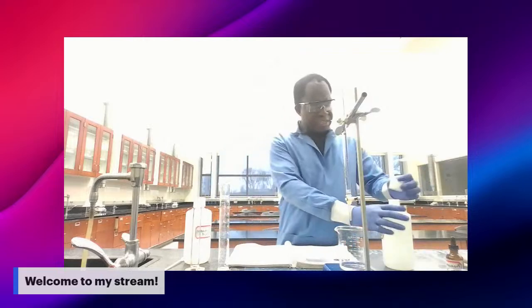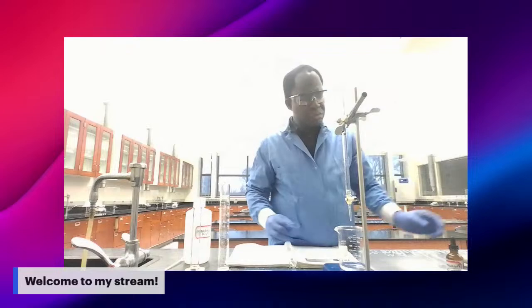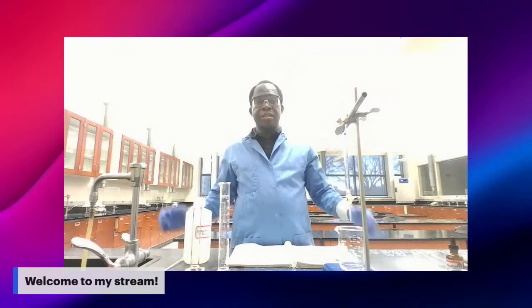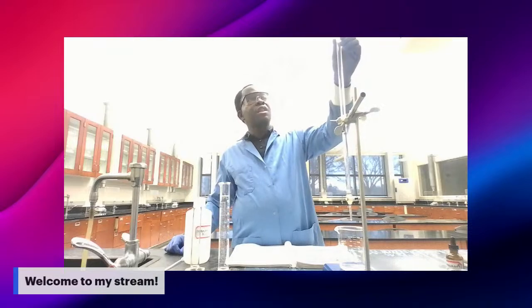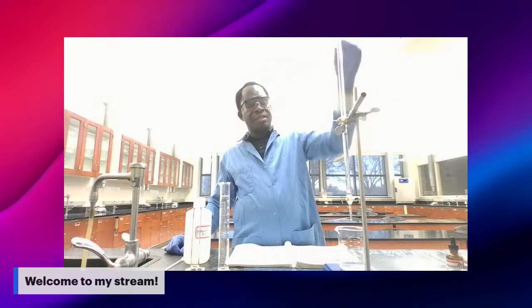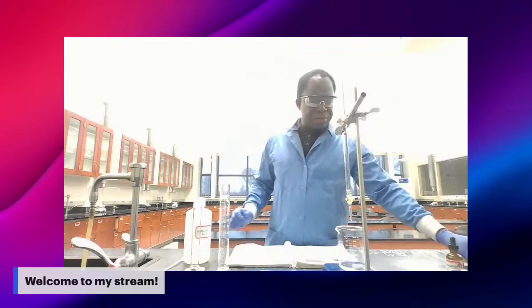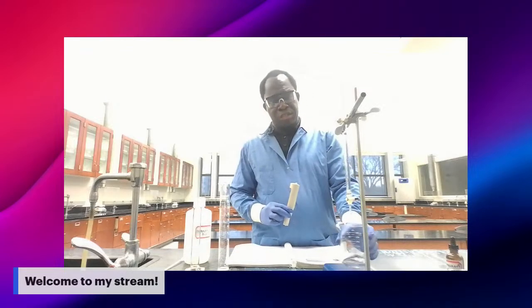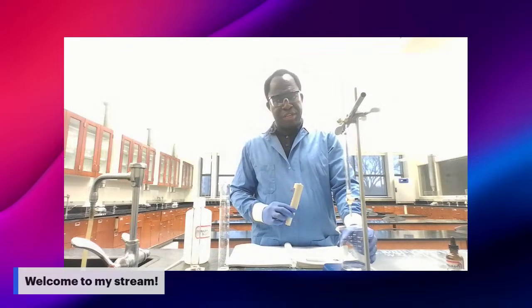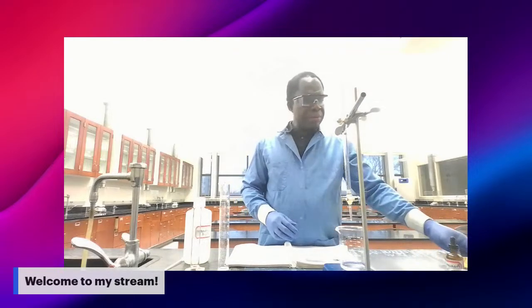Now for this titration, our goal is to draw a titration curve. Each time you add 1 milliliter of base to the acid, you have to determine the pH of the solution.